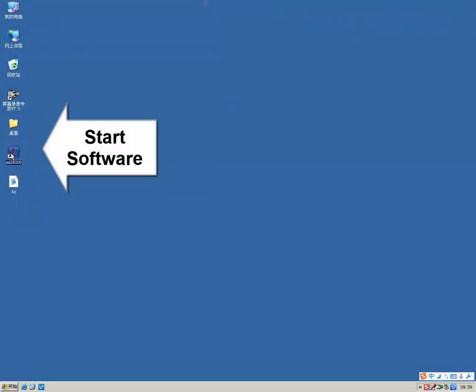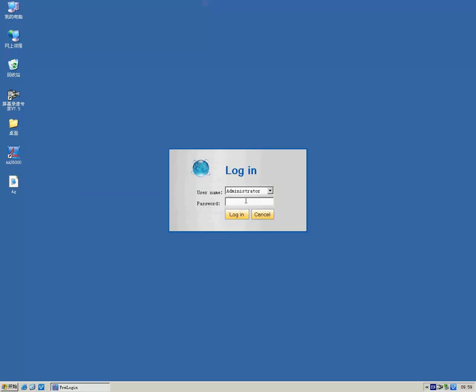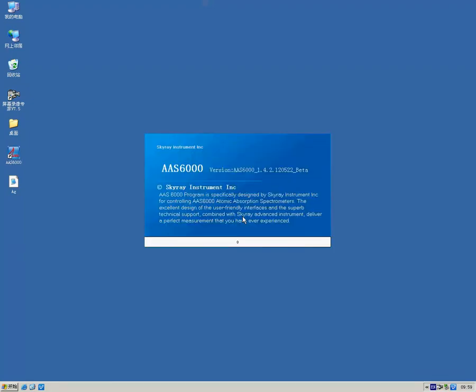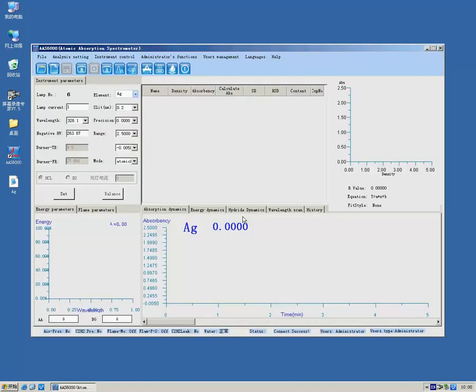Launch the software. Enter your username and password to log in.